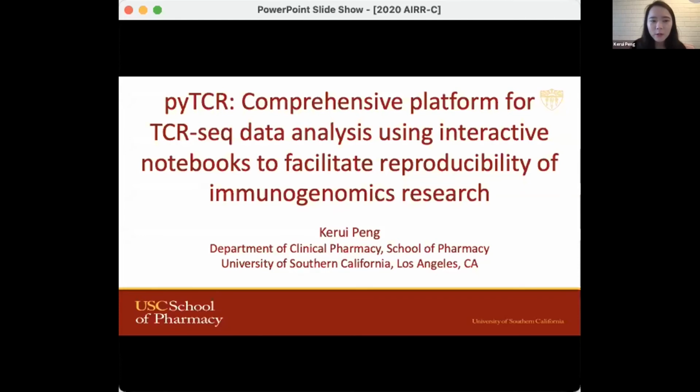This work is still going on, and we are working with Dr. Mike Shugai, who is the developer of MiXCR and also of VDJ tools. We are collaborating with him, and we will provide more functionalities that we can put in our platform.